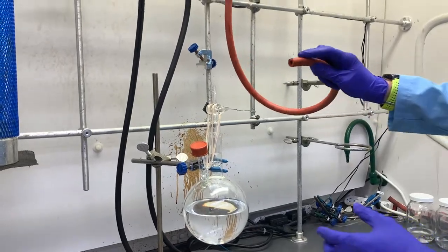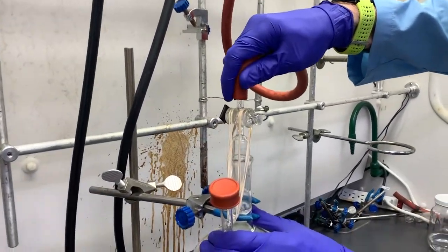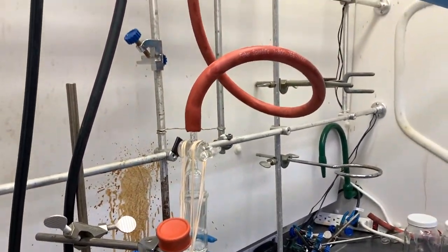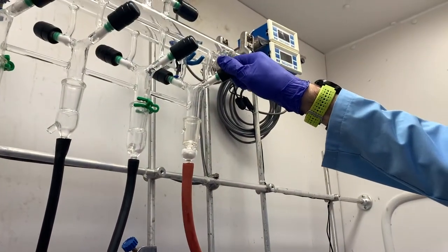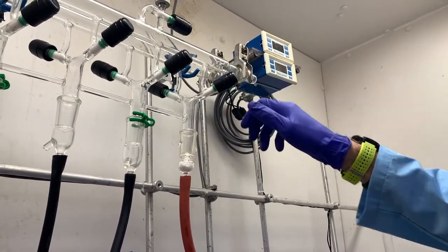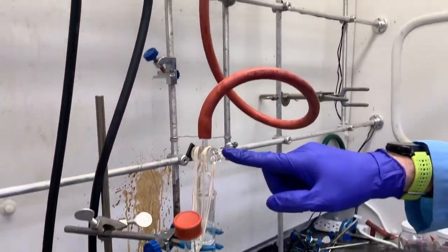Alexa will take her flask back to the Schlenk manifold and re-attach it to one of the taps on the line. Do not open the flask until you have evacuated and refilled the hose itself to make sure the hose is completely clear of air.